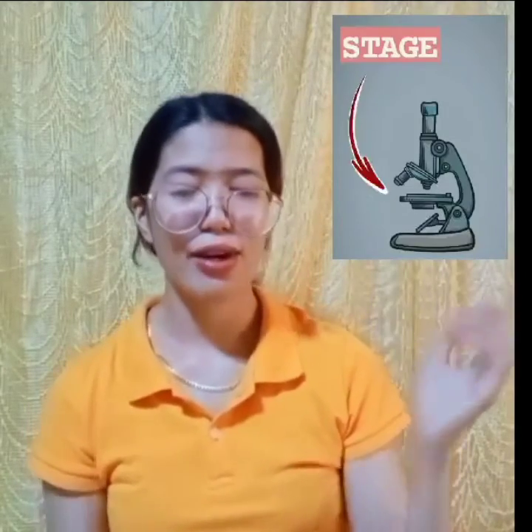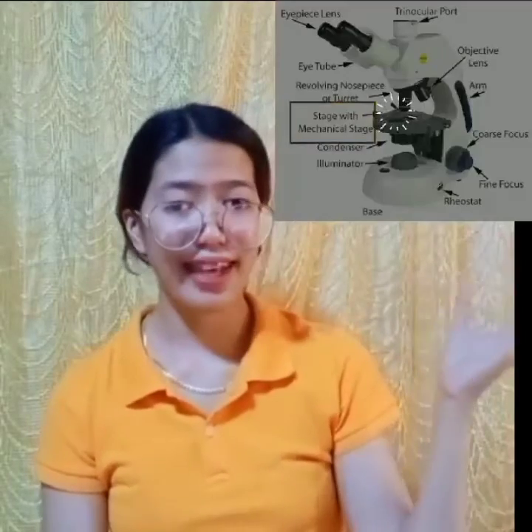And we have different kinds of objective lenses. First is 4 times as a scanning objective, 10 times as a low power objective, 40 times as a high power objective, and 100 times as a high power oil immersion objective. Next is the stage, where the microscope slide rests. Next is the stage clip, the one that holds a slide. And next is the mechanical stage, a stage with adjustable brackets.